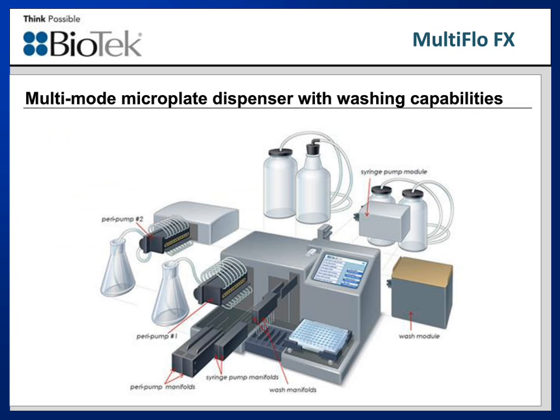Also, two syringe pumps, which can be seen in the upper right-hand side. Those are for dispensing of bulk reagents. Also available are cell-friendly dispense and wash tubes with adjustable flow rates, which can be used for media exchanges, etc. The small footprint of the instrument, as well as the touchscreen controls, are ideal for use within a laminar flow hood, which is typically where our instrument is housed in our tissue culture facility.